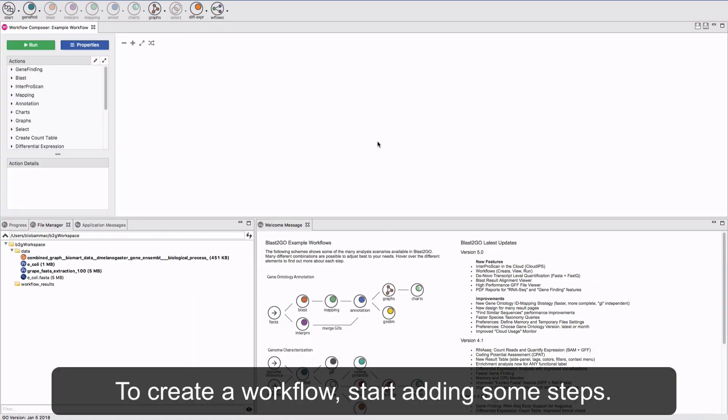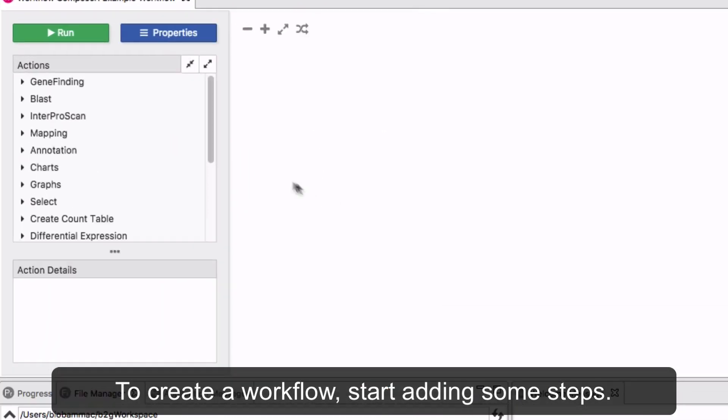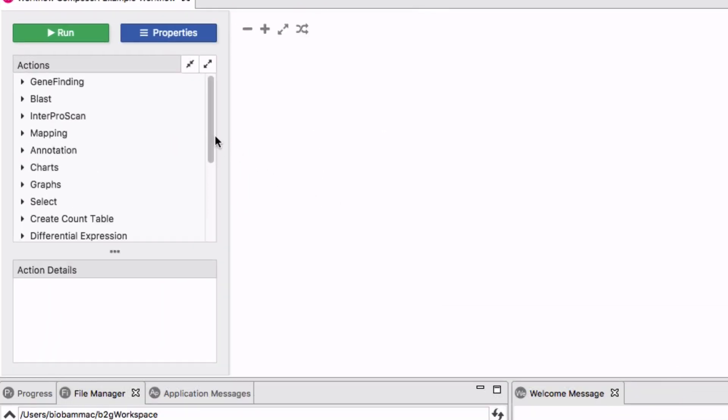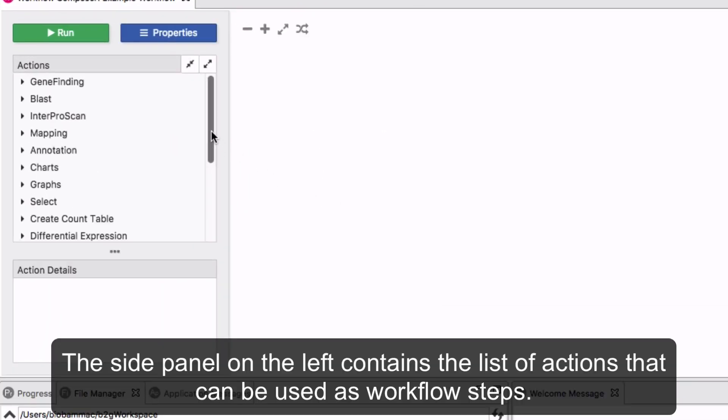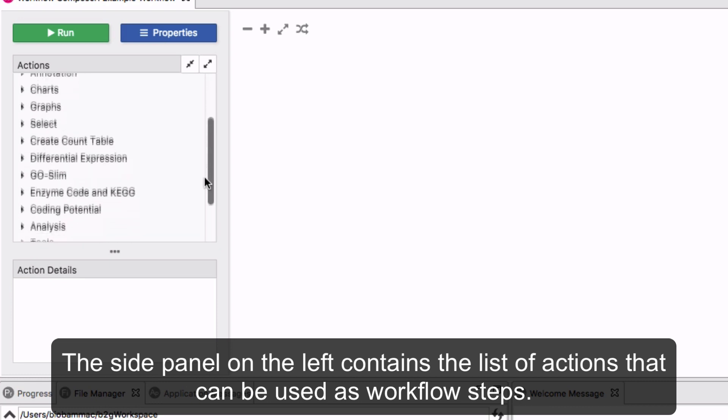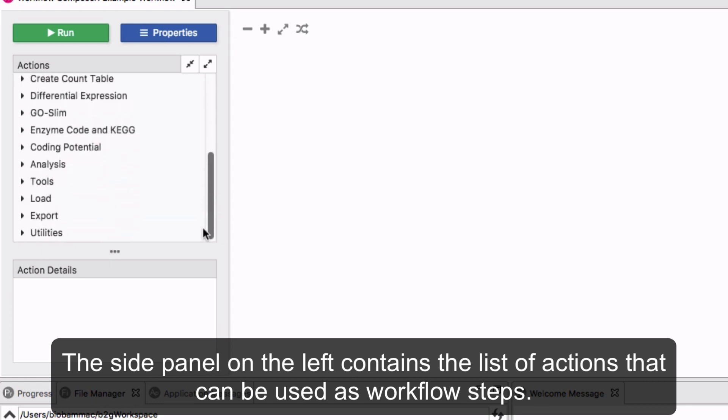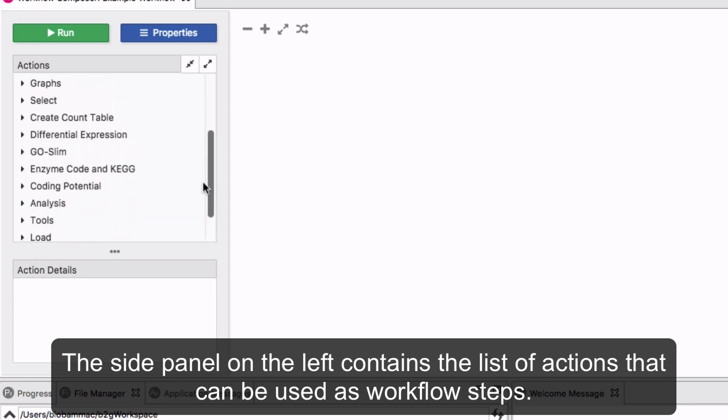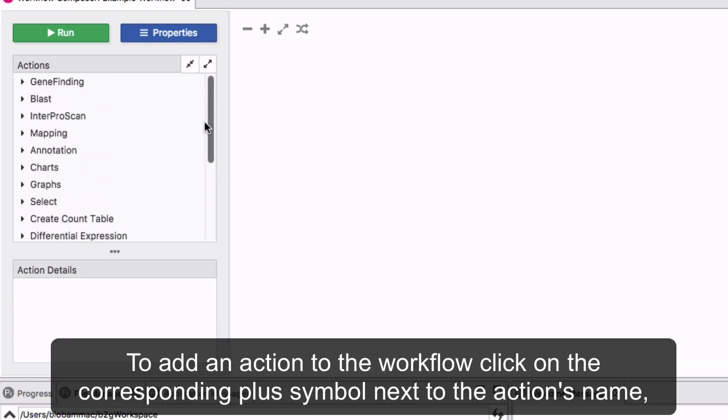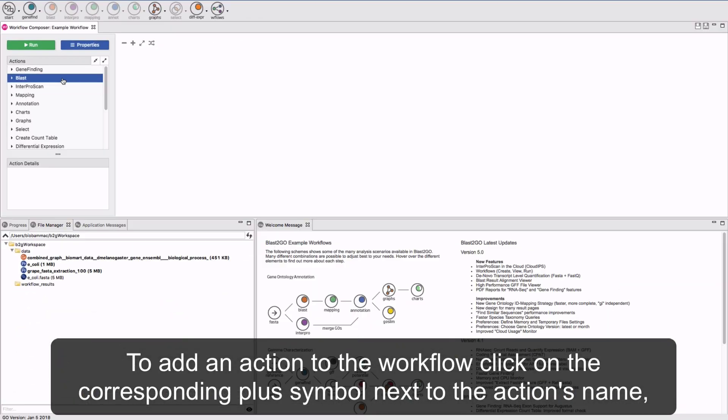To create a workflow, start adding some steps. The side panel on the left contains a list of actions that can be used as workflow steps. To add an action to the workflow, click on the corresponding plus symbol next to the action's name.